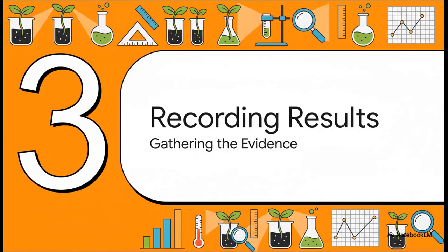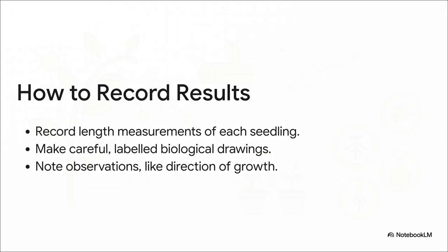Okay, the experiment is all set up and running. Now for the bit that actually earns you marks in an exam, recording your results like a pro. You're basically a detective gathering 3 types of evidence here. First, the numbers, the quantitative data. You'll need to measure the height of your seedlings. Second, the visual evidence. This means making big, clear, labeled scientific drawings. And third, your qualitative observations. Just writing down what you see, things like which way they're growing or if their color changes.